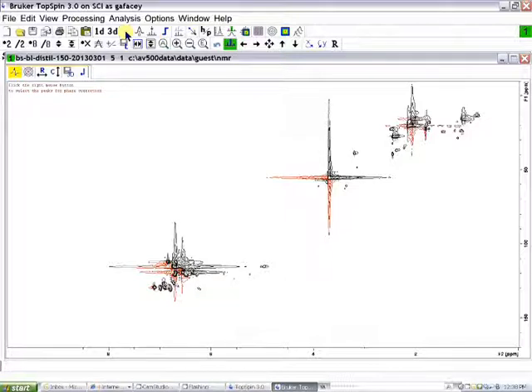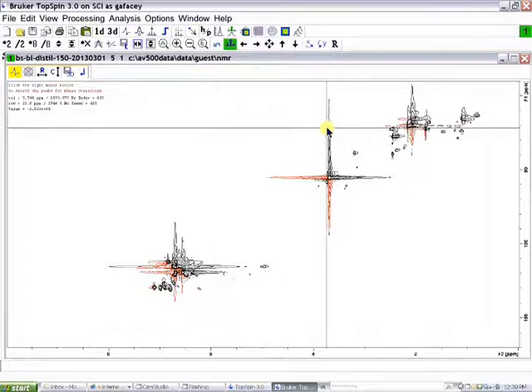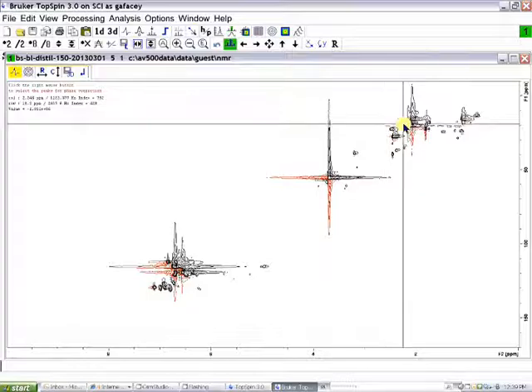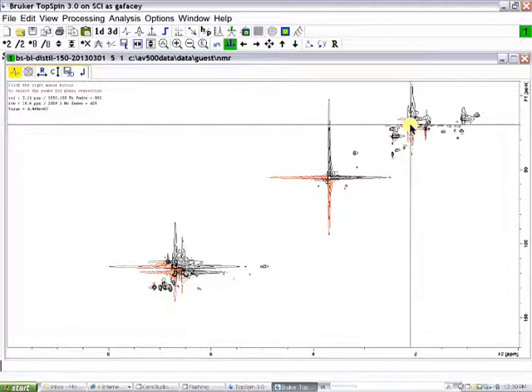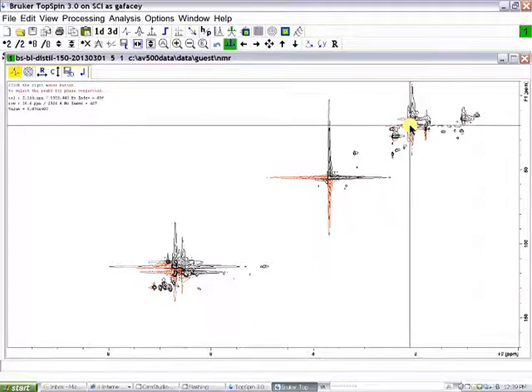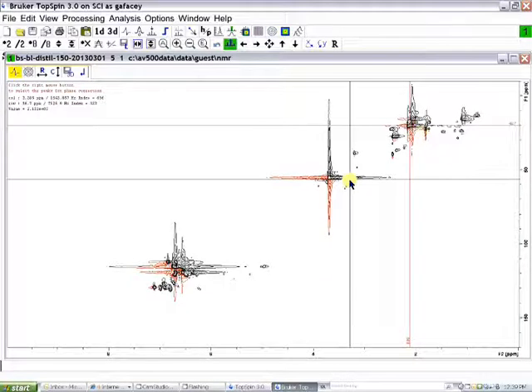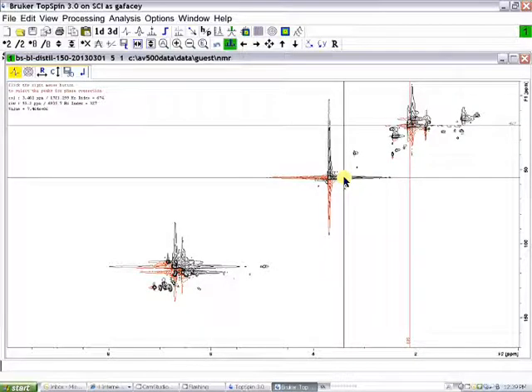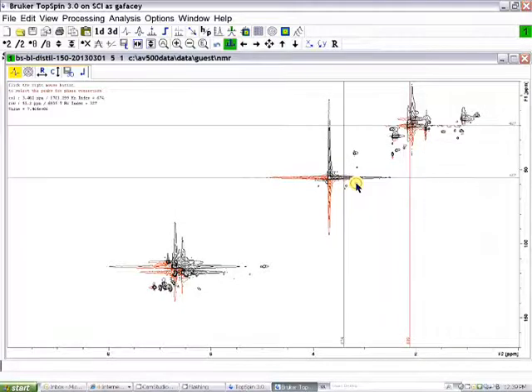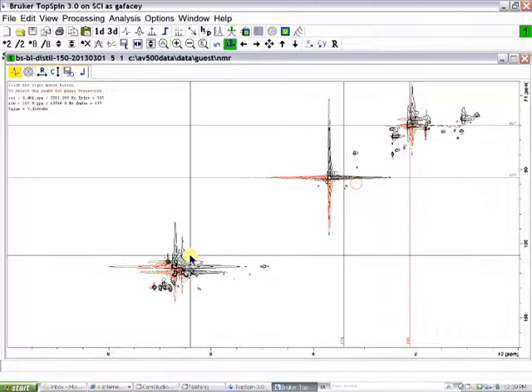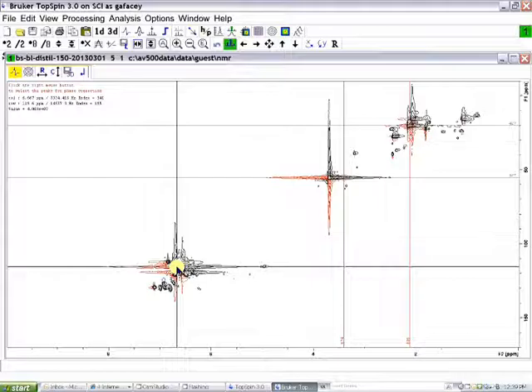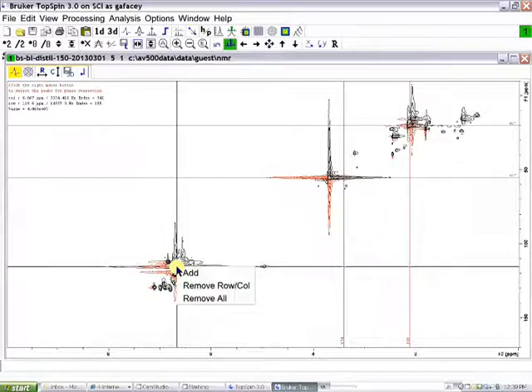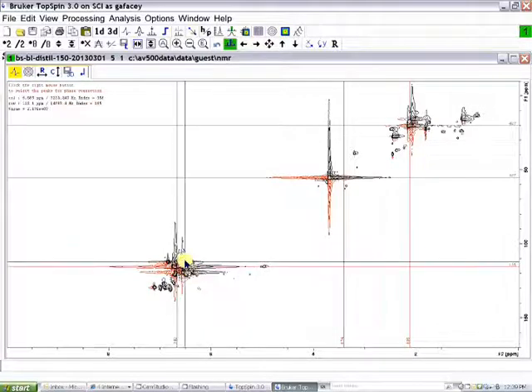So we put our cursor on a large signal, use the right-hand mouse button to click, and then add. We take another signal, a large signal, right-hand mouse button, add. Then a third signal from another region in the spectrum, right-hand mouse button, and add.